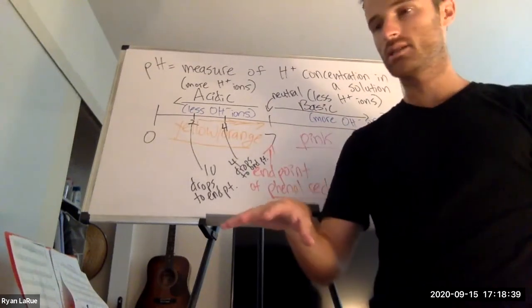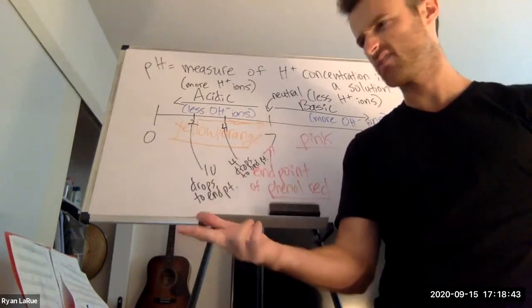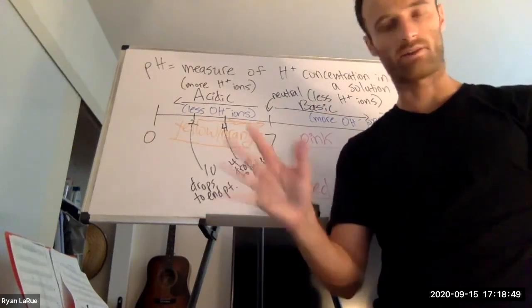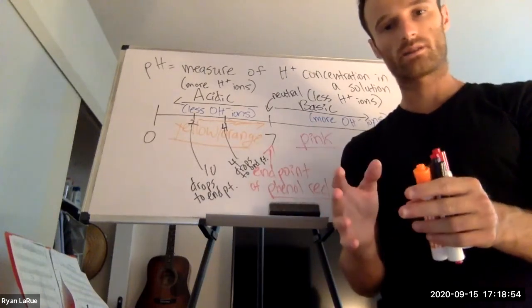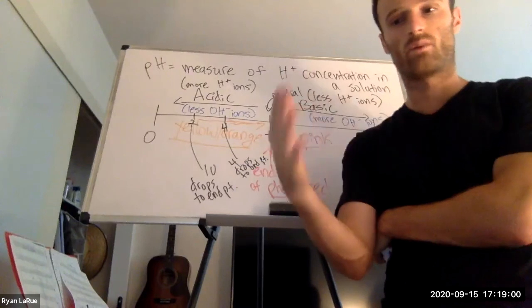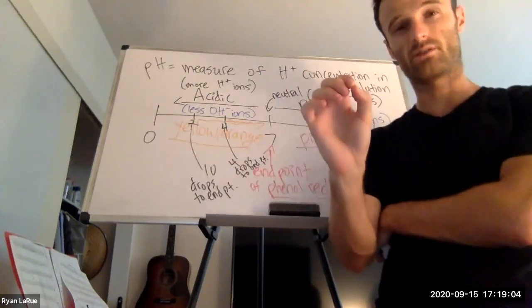And the substance would be the pancreatin, urine, saliva. What was the other one? Gastric juice, whatever. And so you would want the average number of drops, because you're going to do each one twice. Stacy does each titration for each solution substance twice.